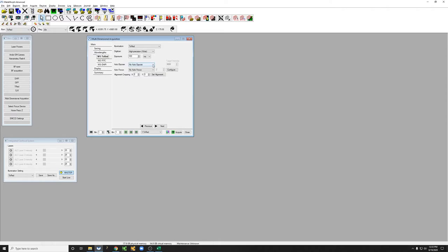We don't want to auto expose, and we typically don't want to auto focus, so we're going to leave those alone. And we don't do any alignment cropping.